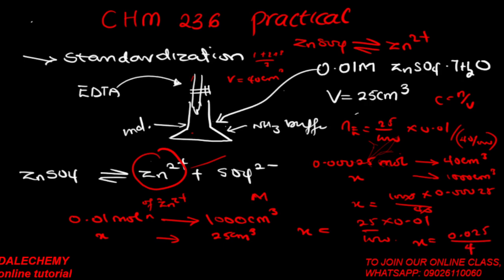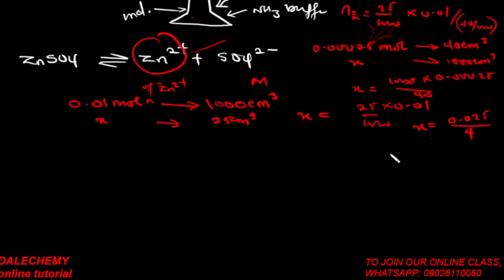That is going to be x equal to 0.0063 molar. So that is the concentration of your EDTA.